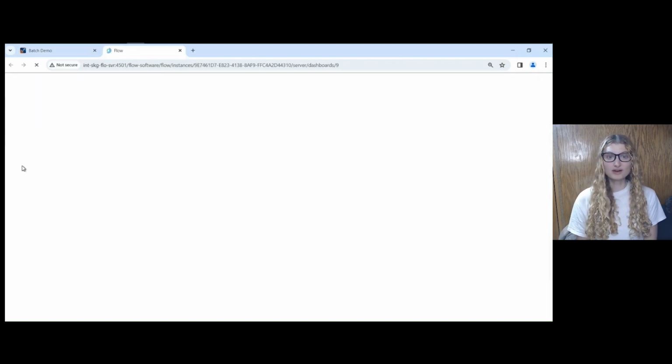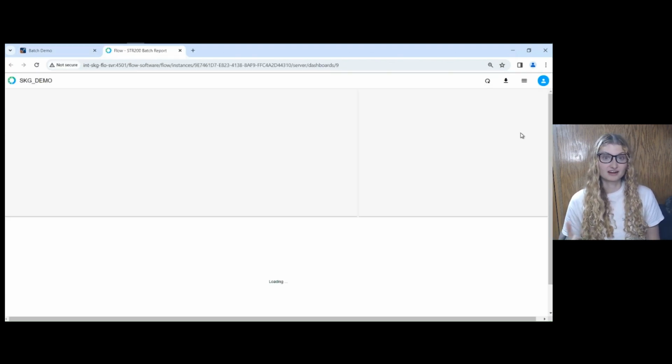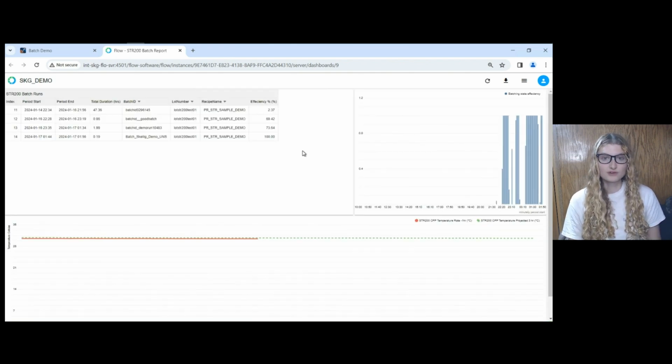Now, we can gain more insights from our data by using a data analytics software like Flow. From my browser, we can click the Data tab, which brings us to Flow's web page-based display. If I wanted, I could create a visualization in Ignition that uses all of the calculation and models created in Flow because that's an open software. It likes to share. But I happen to like Flow's out-of-the-box chart components, so I use their web page here. Again, great thing about being open means the end user ultimately has the choice and the options. Let's explain what we're looking at.